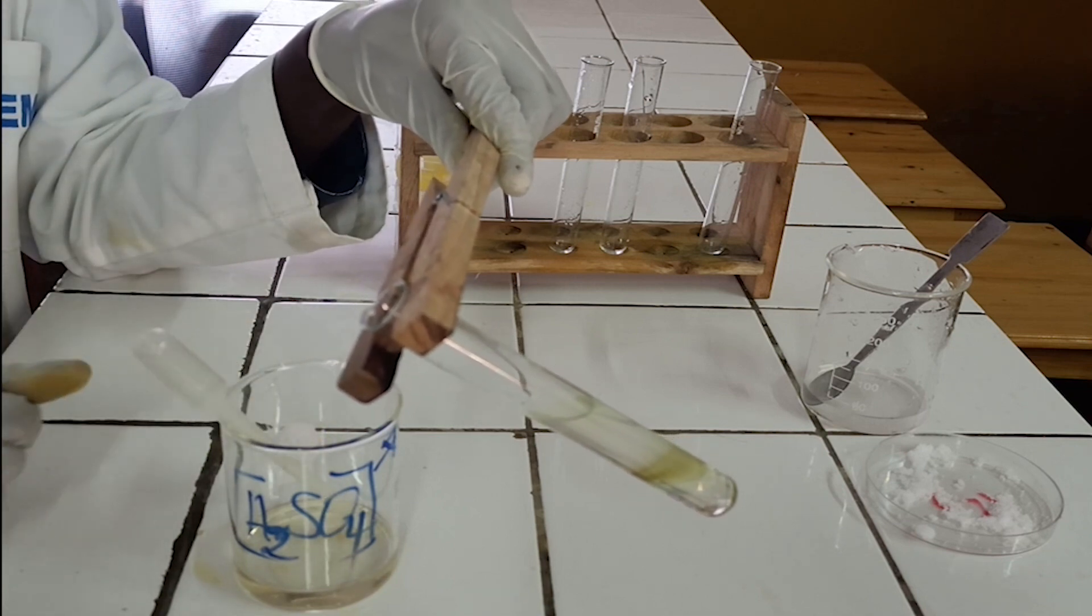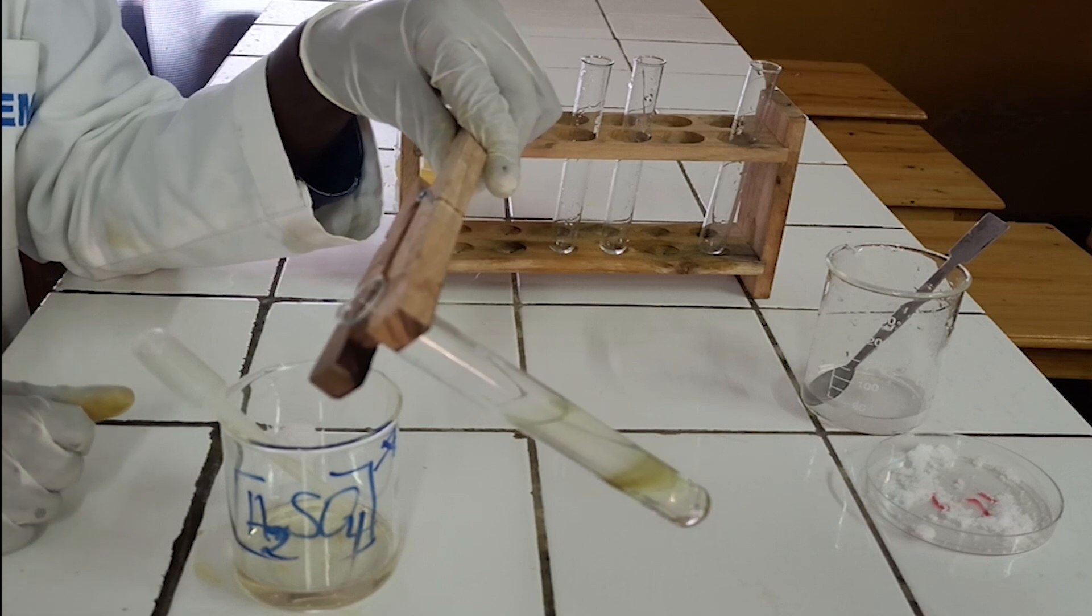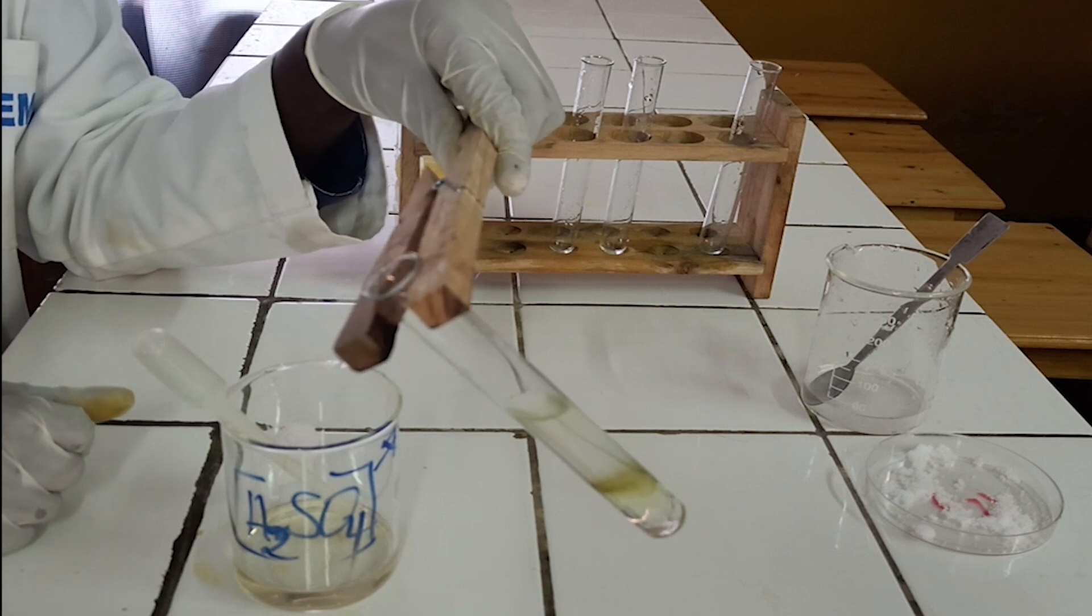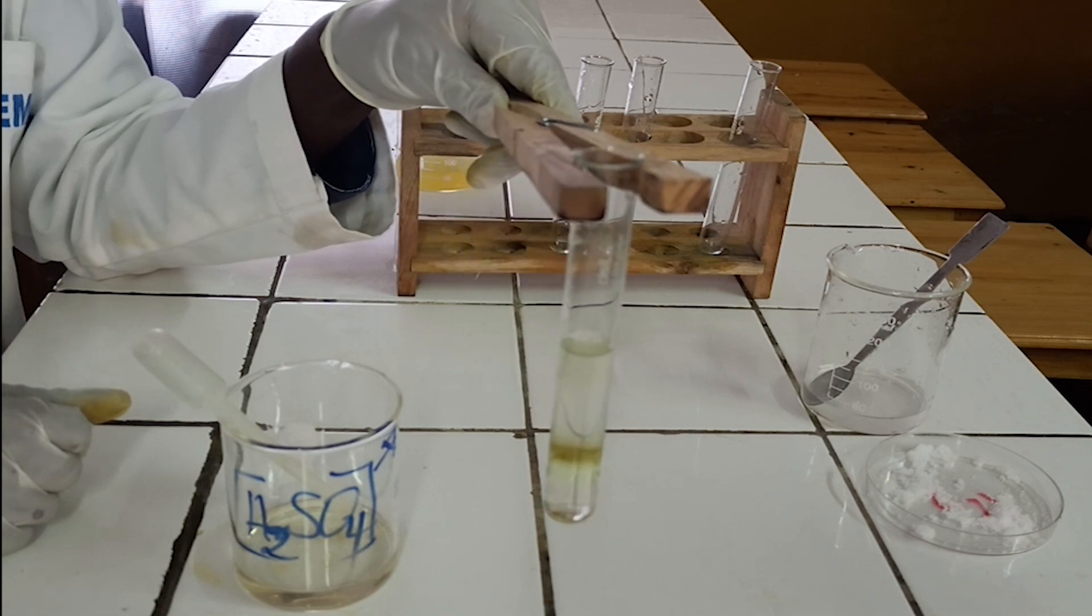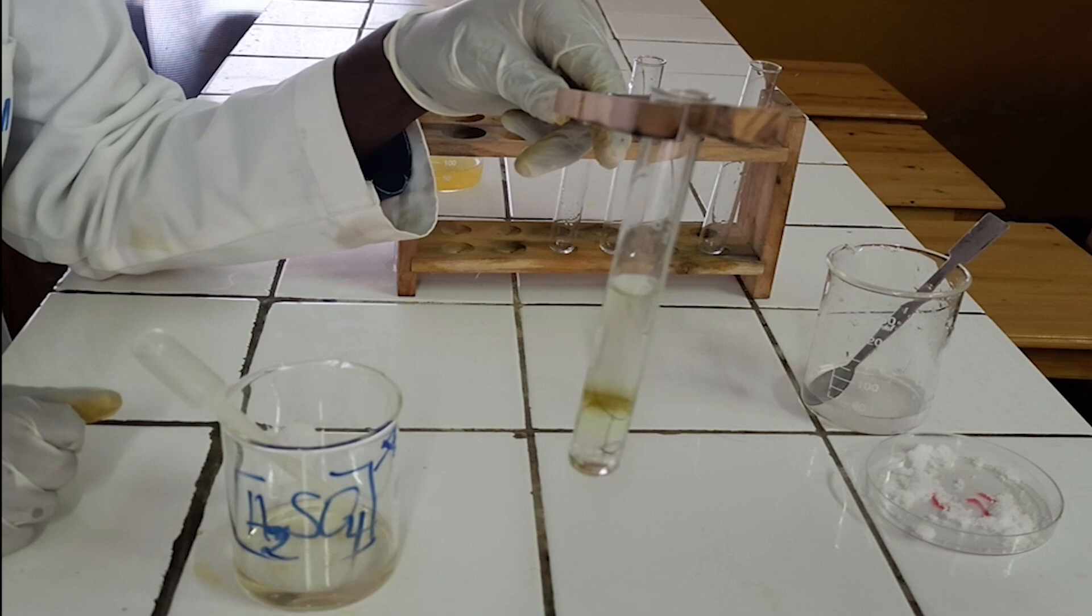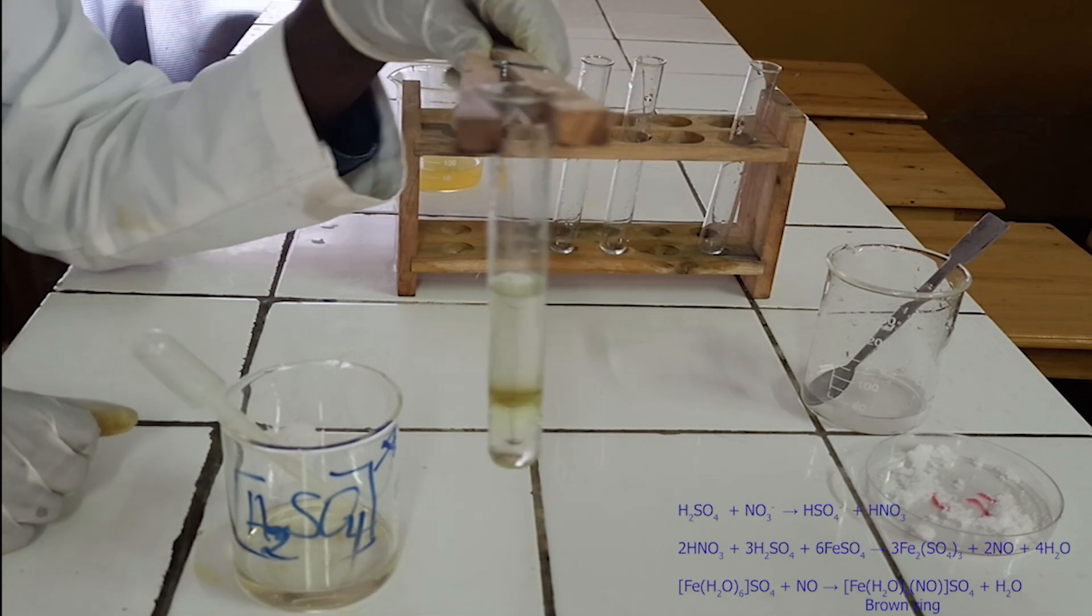As you see, iron-2-sulfate reacts with nitrate ion in acidic medium to form brown ring between iron-2-sulfate solution and concentrated sulfuric acid. Below, there is chemical equation for this reaction.